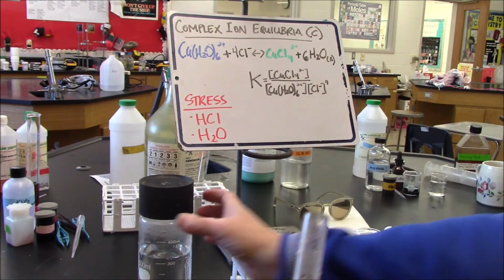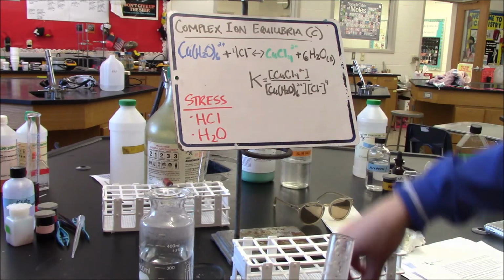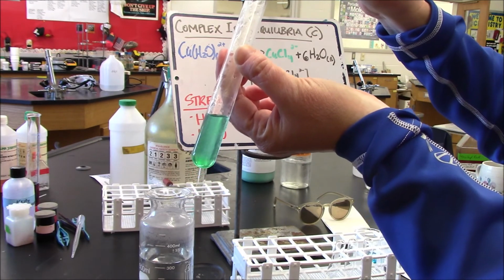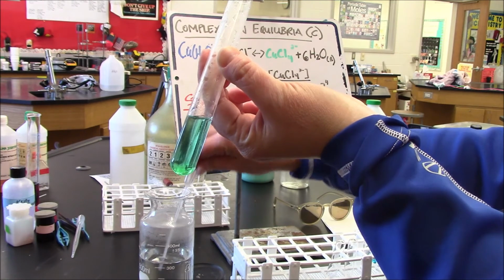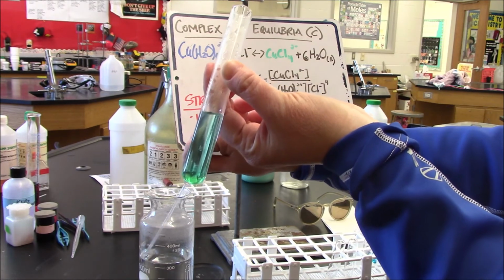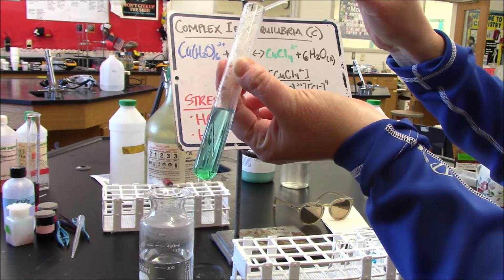Now I'm going to add excess water and shift my equilibrium in the opposite direction. Continue, you can start to see the solution is going from green back to blue. Continue, and now you can see it's changed. It's back to blue.